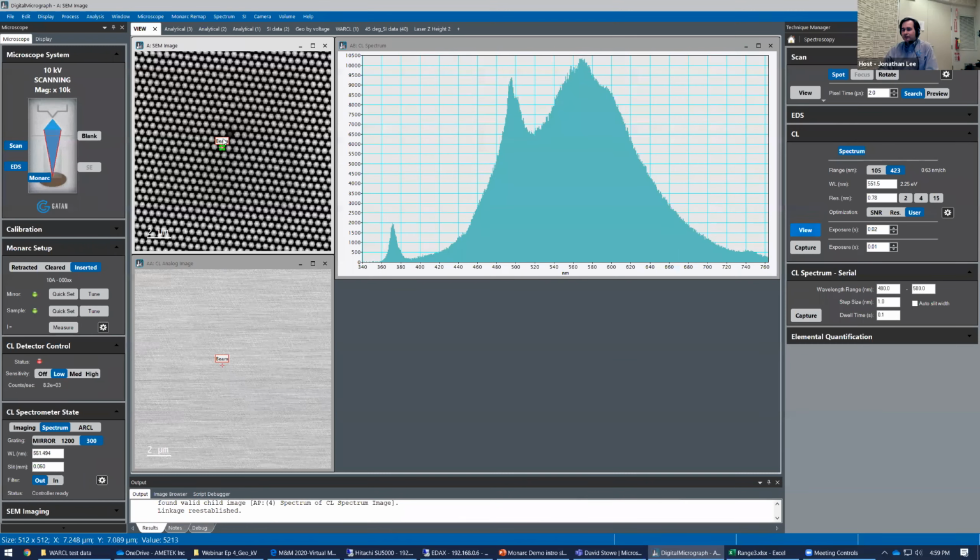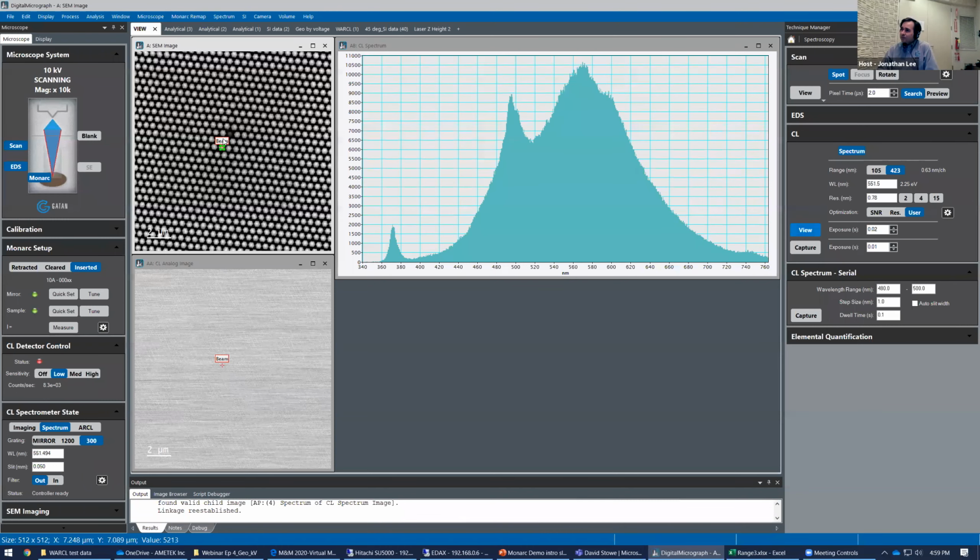In general, nothing is going to have an infinitely narrow bandwidth. I mean, that's why I'm asking, can you put any kind of rough number on it? Even order of magnitude. Do you have 10 nanometer wavelength resolution, or is it, right now, 1 nanometer? I can get well below 1 nanometer with the 300 grooves per millimeter grating. I can go even further with my other grating, a 1200 grooves per millimeter grating, which is much more dispersive. But I can only fit 100 nanometers on the CCD in that case.